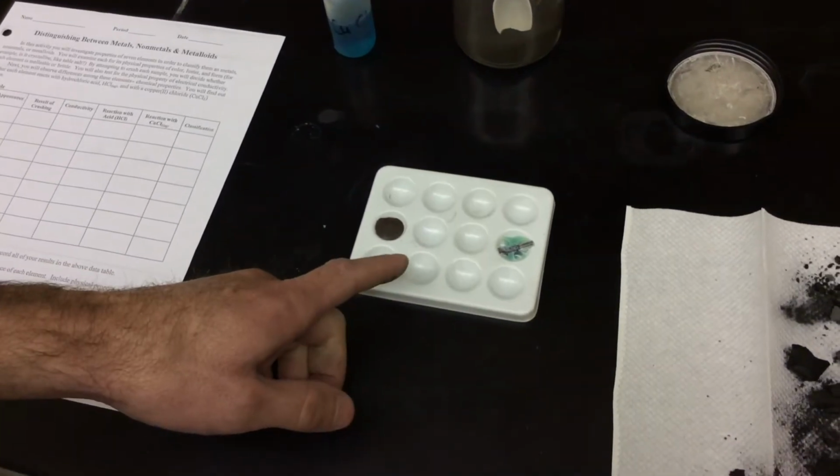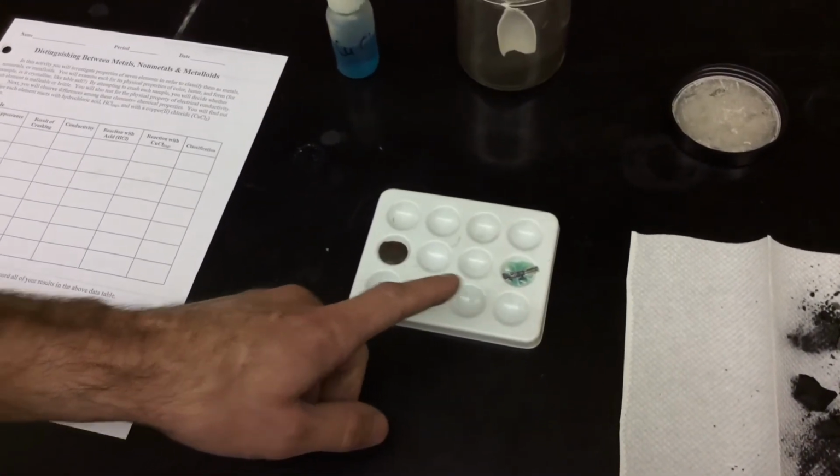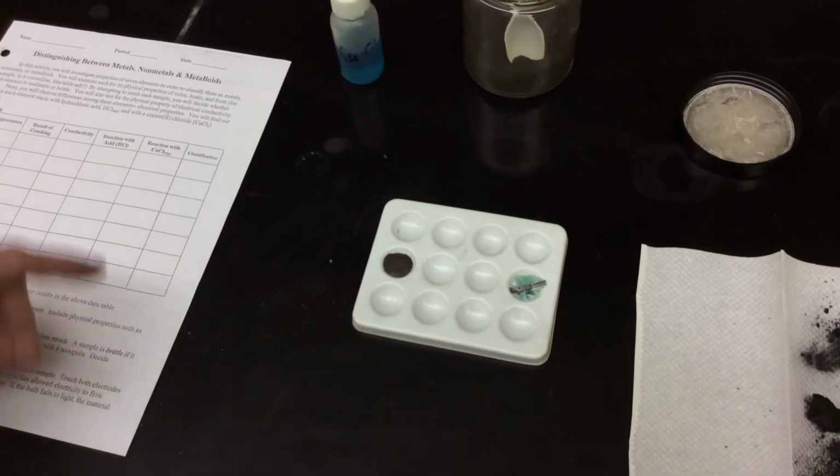When you're done with these solids, this should go in the metal trash can. So what you do is take one of the squirt bottles, walk the well plate up to the trash can and spray this stuff in there. But don't throw the well plate out because other classes are going to need that.